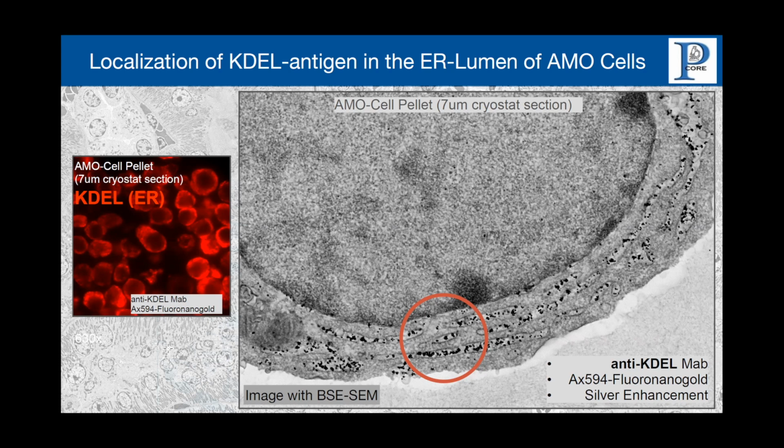In fact, we nearly only use standard TEM staining protocols, because I often found that when we get too dense metal, this can cause artifacts. And when you use more traditional TEM staining protocols, for some membranes you may have lower contrast, but overall you have a wider scale of gray levels. And this can also be informative, actually.